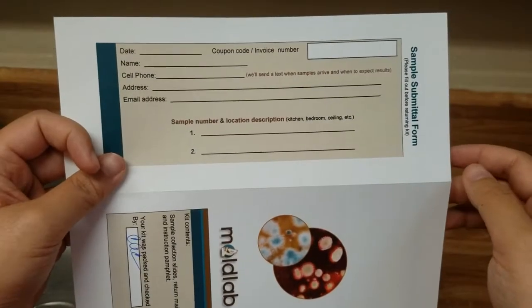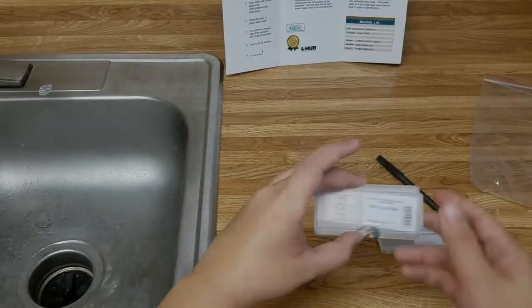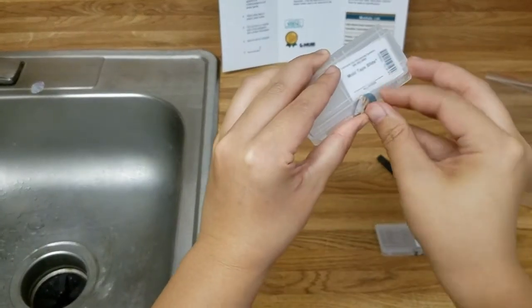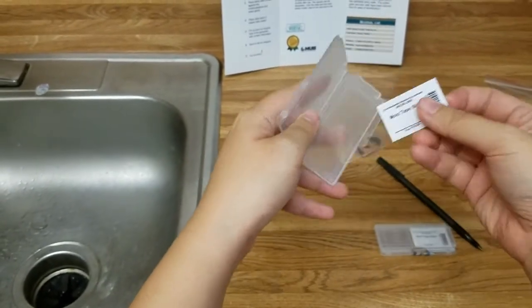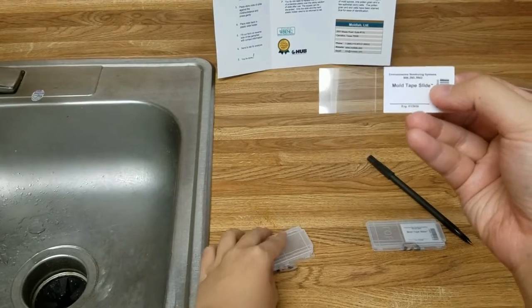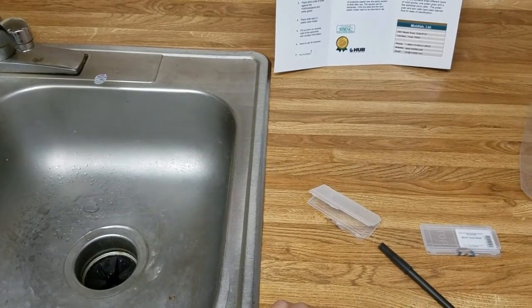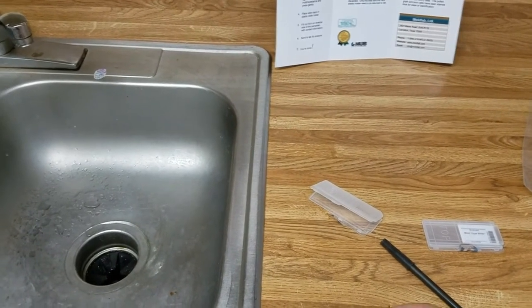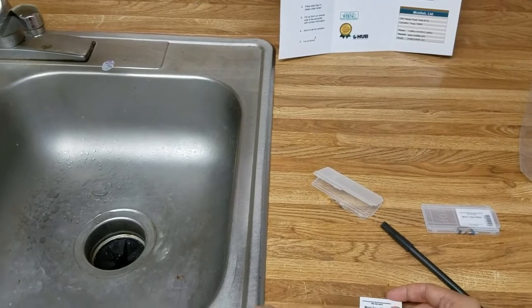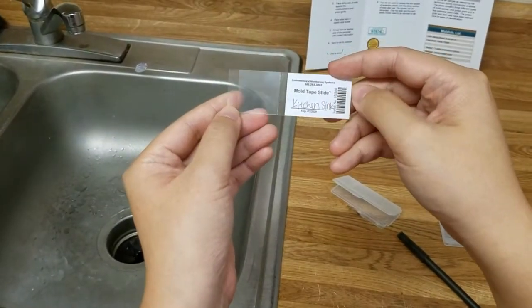Now without further ado, let me show you how to take some samples. Here's the slide — we're just going to open this up. So the first part of the mold sampling instruction says to record the sample location on the slide label. I'm going to be taking a sample from my sink in the kitchen, so I have labeled it 'kitchen sink.'